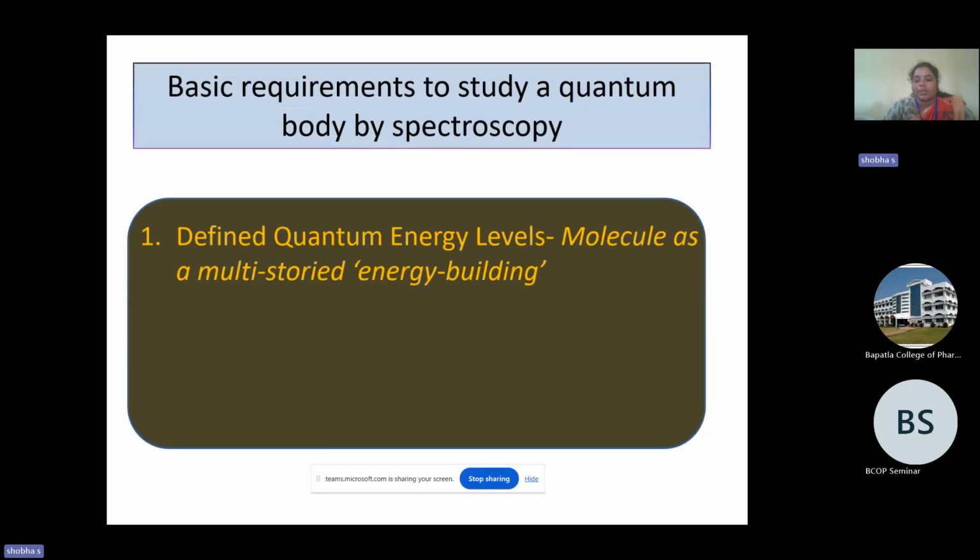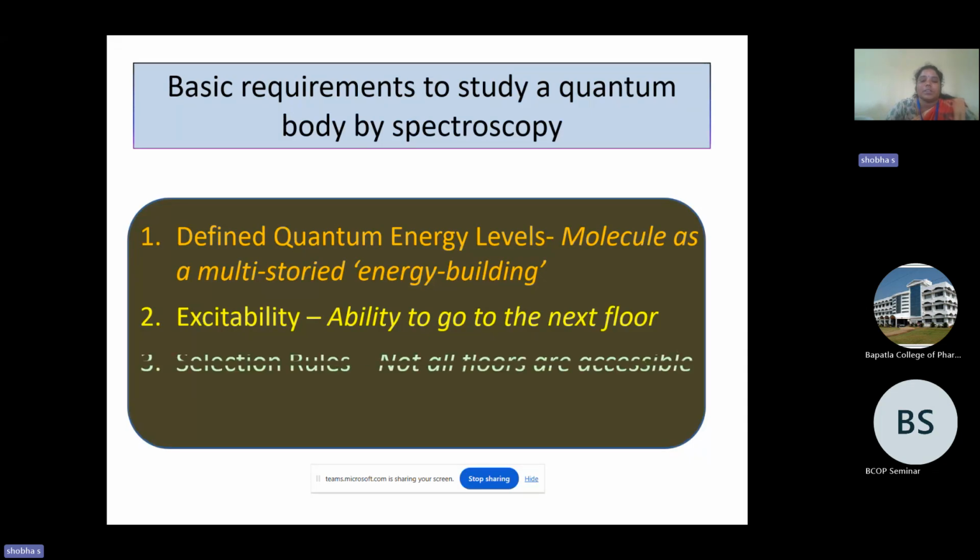Before starting our IR spectroscopy, there are many contributions from all the disciplines like bioinformatics, chemoinformatics, as well as the laws abided by physics. We already know quantum mechanics. The Schrodinger equation will be important for us to know how the atoms have these energy states. Those we are going to see by means of quantum mechanics. That is excitability, how the proton will be excited by absorbing the radiation.